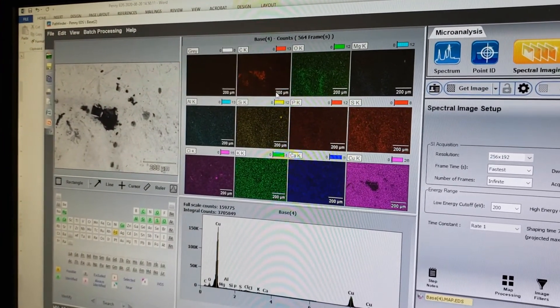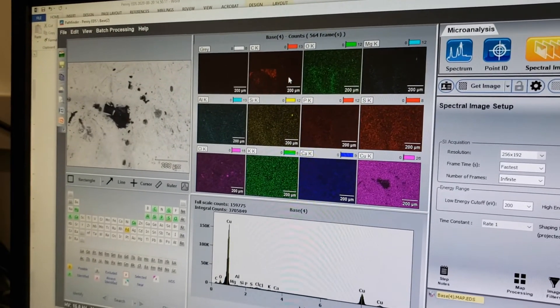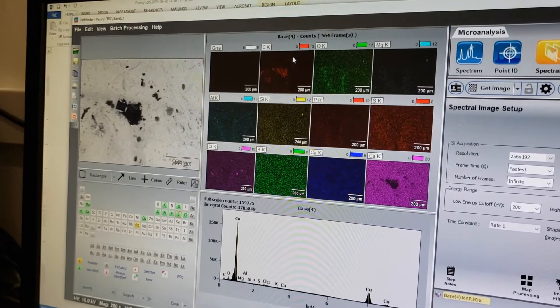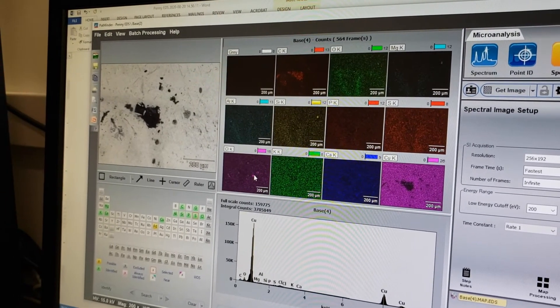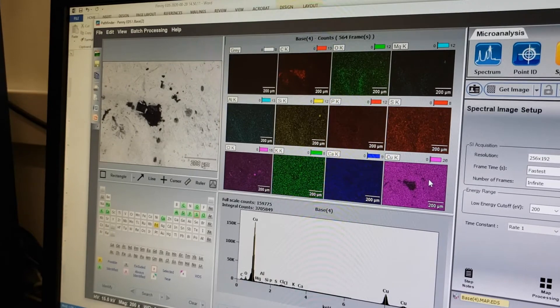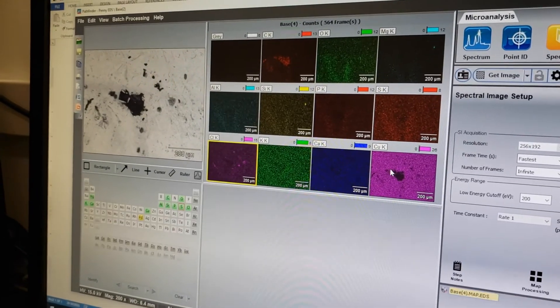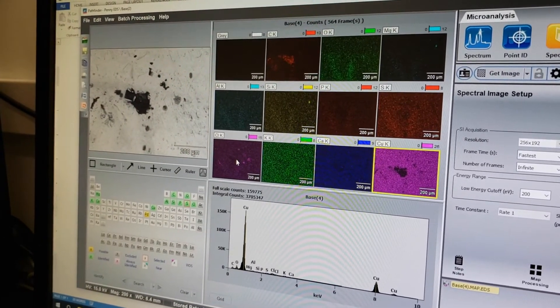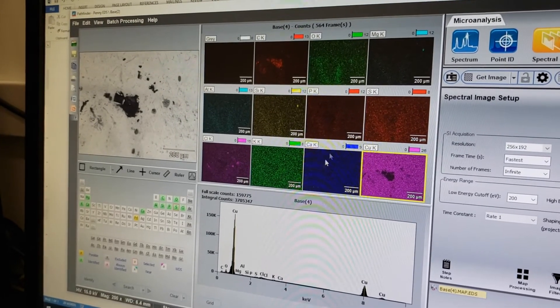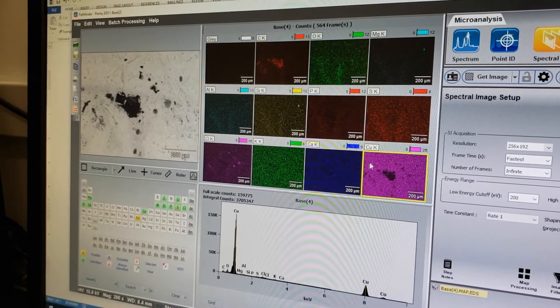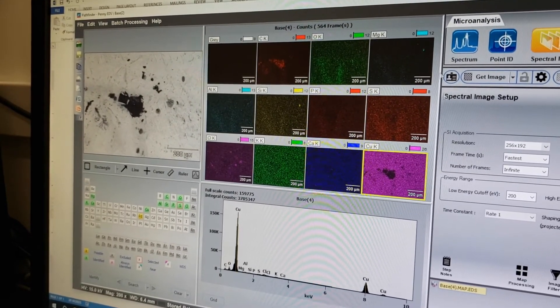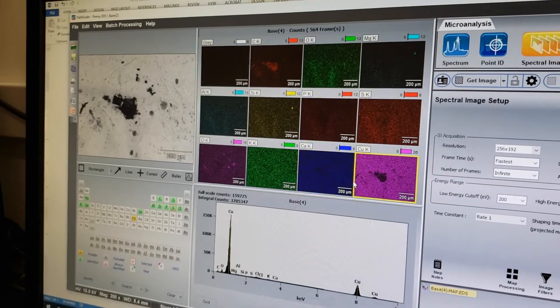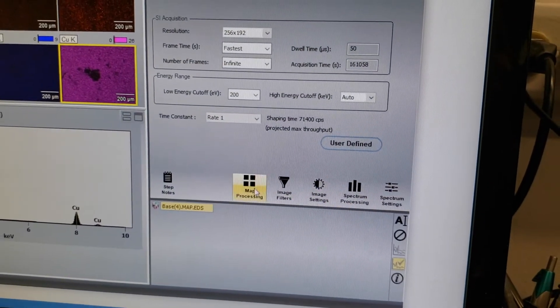A problem we have here is duplicating colors — we've got pink here and also pink for another element. If I care about chlorine and copper, I'll have issues with the overlay. Once you export these images you can change colors in Photoshop, but you can also change them right here in the software using the buttons on the right side.